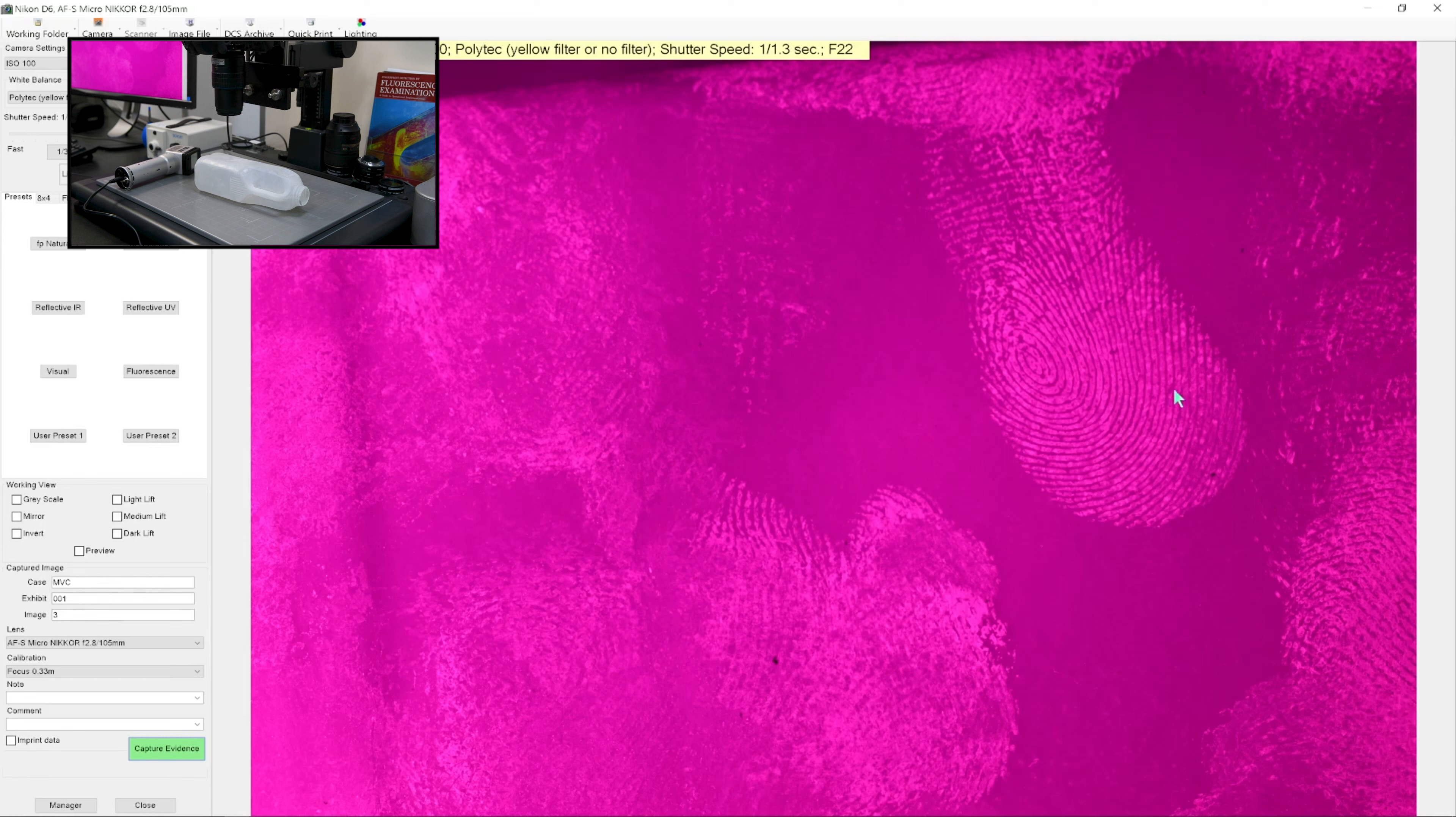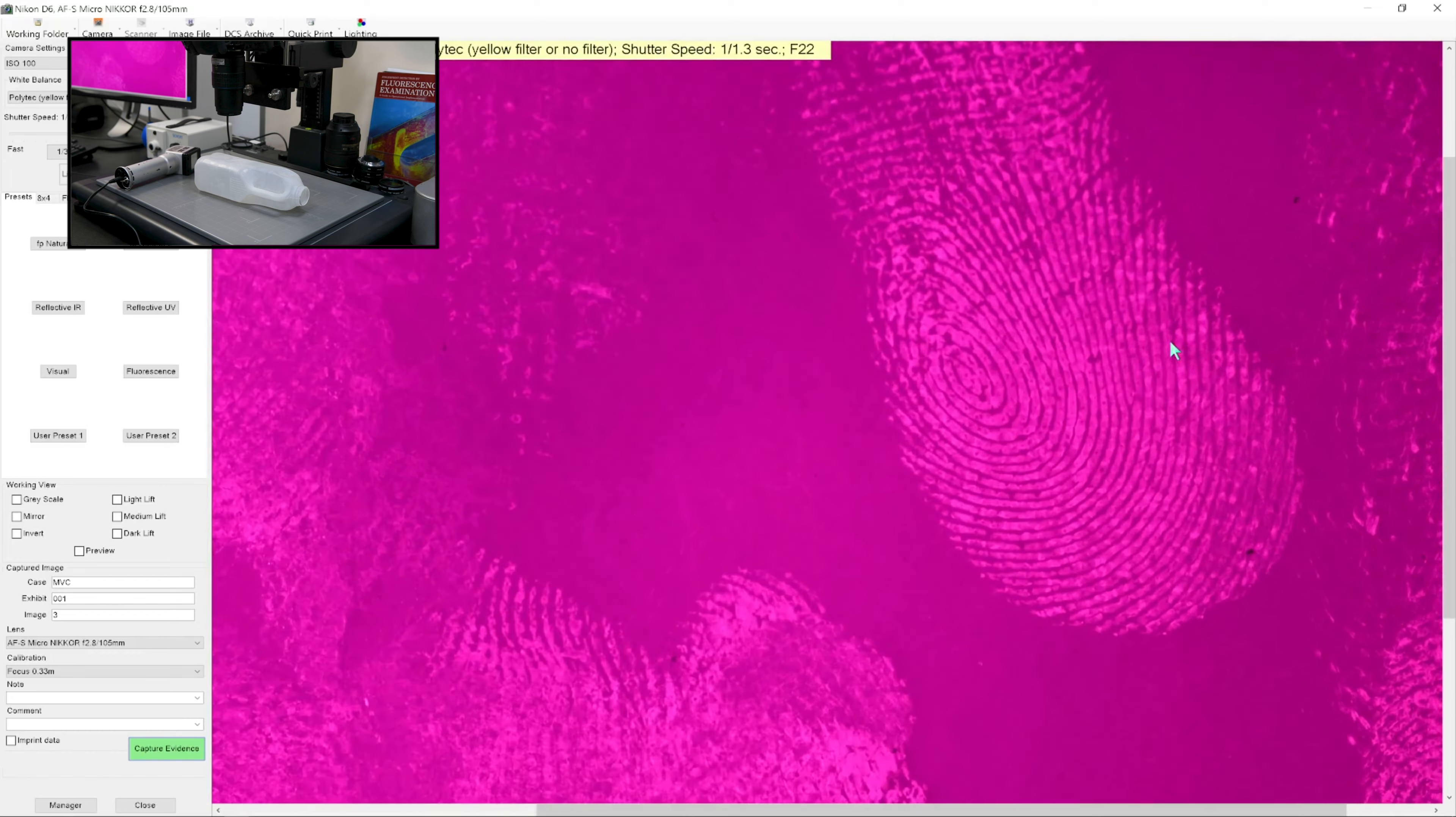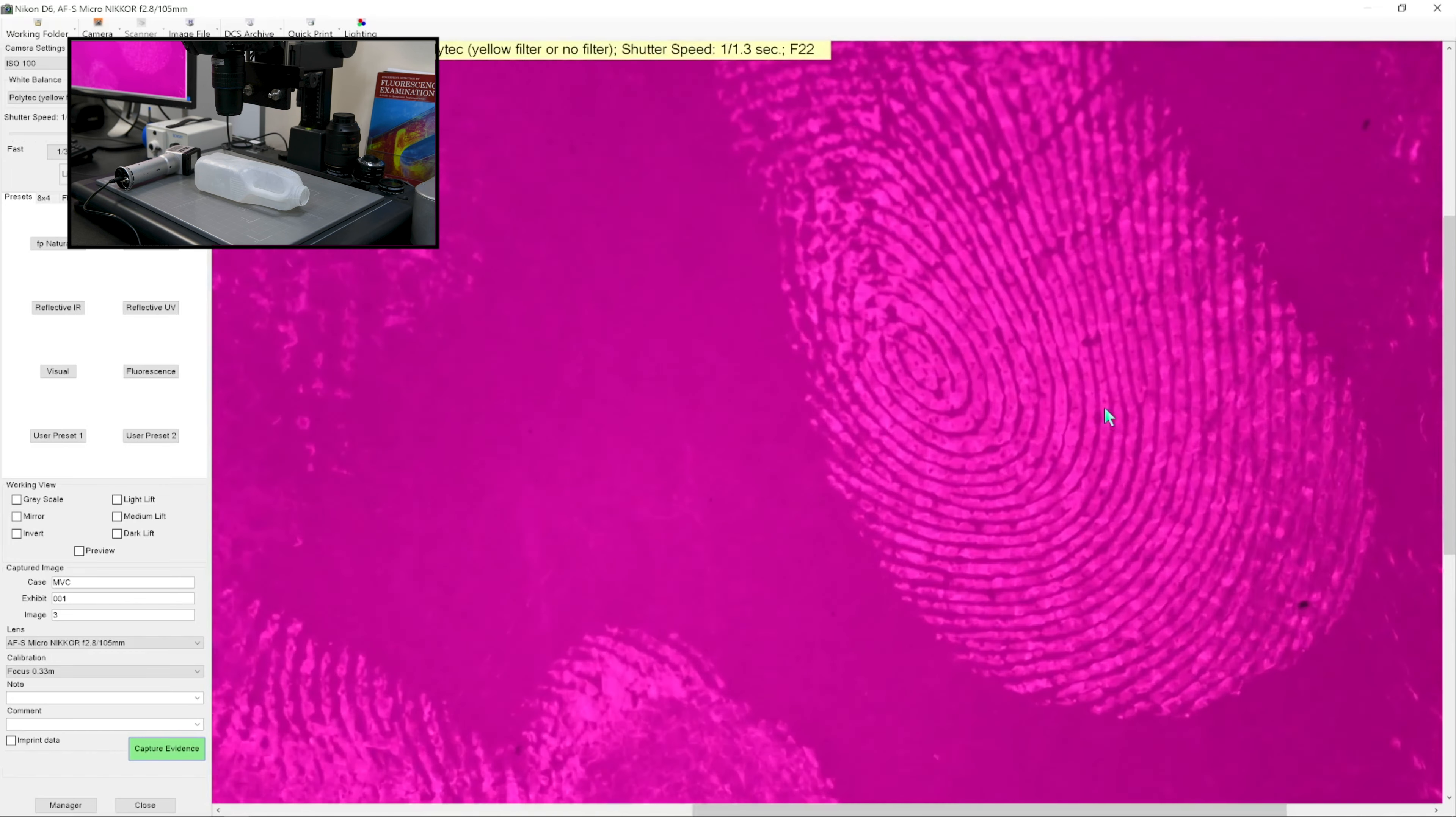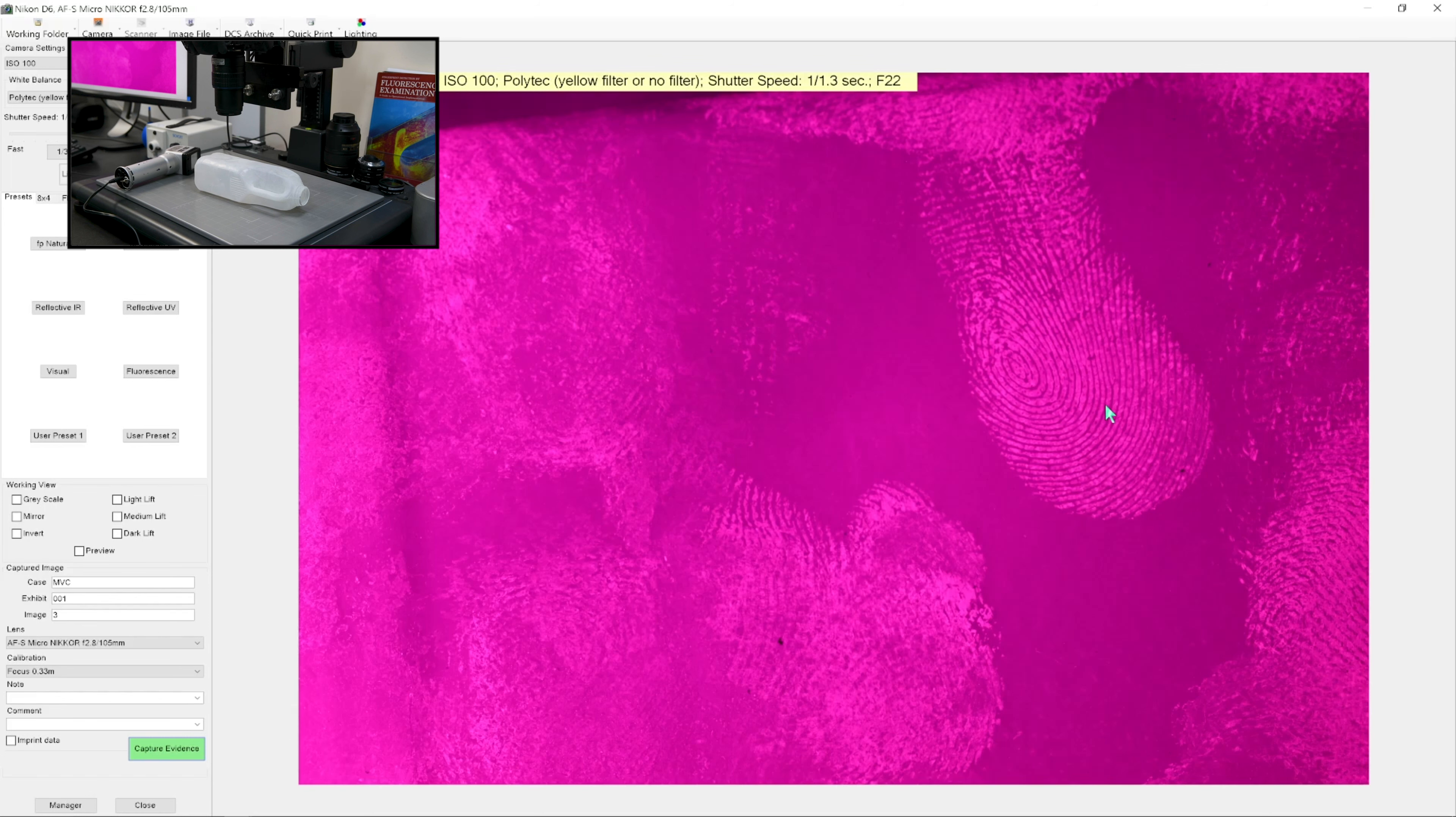But when we use reflected UV, we can see that the scatter coming from the finger mark almost makes it look as if the finger mark is fluorescing. And you saw how quick that was. It's a very quick process that allows for high throughput of evidence that's been treated with cyanoacrylate.